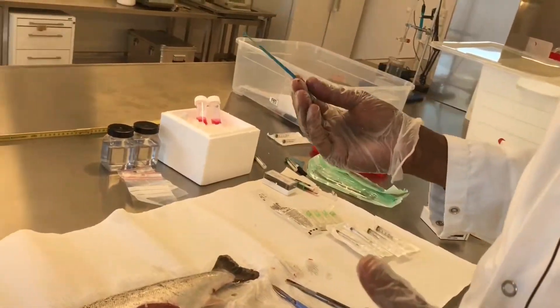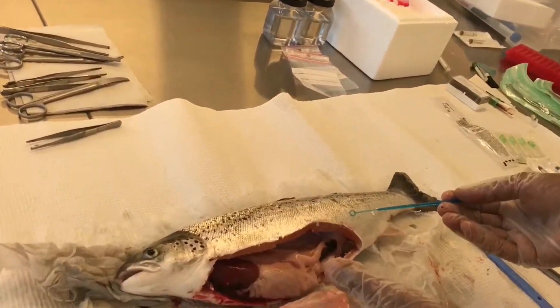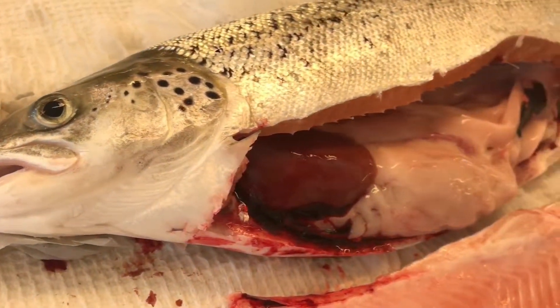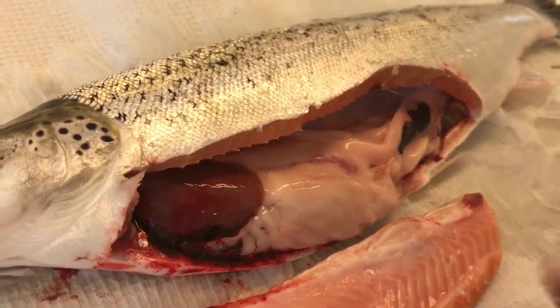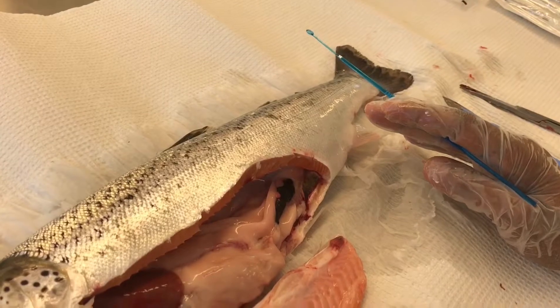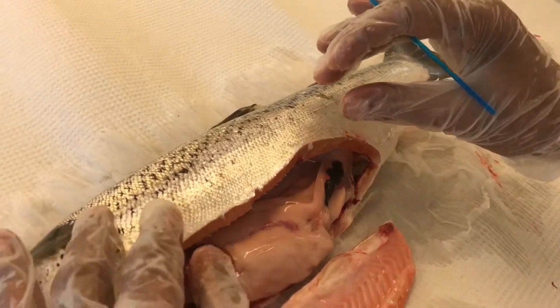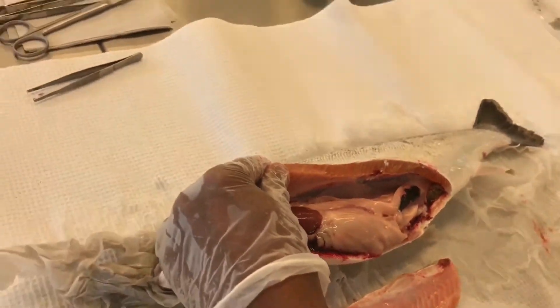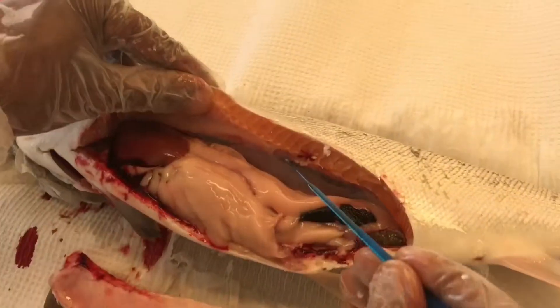After opening the abdominal cavity, we have to take samples for microbiology and molecular biology, which requires good care to avoid contamination. So we insert the inoculating needle into the kidney.